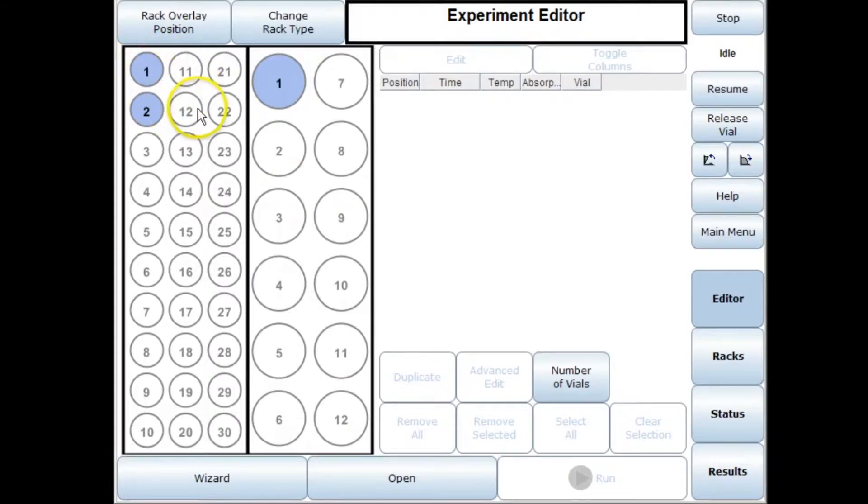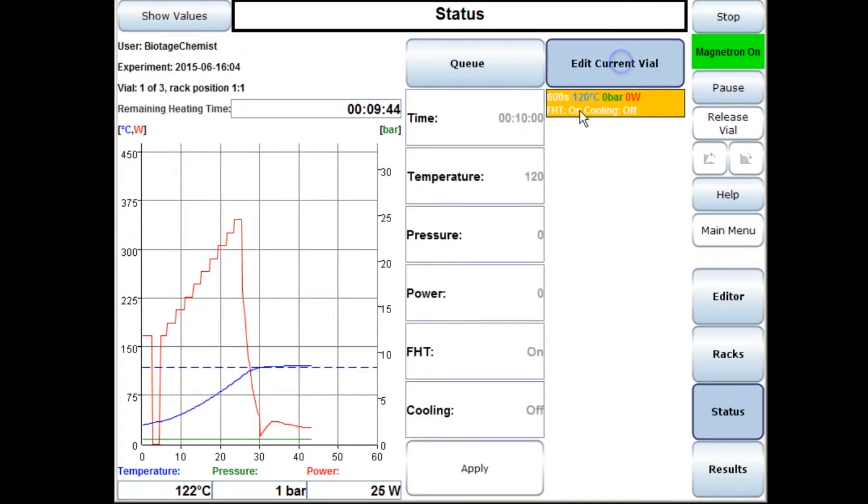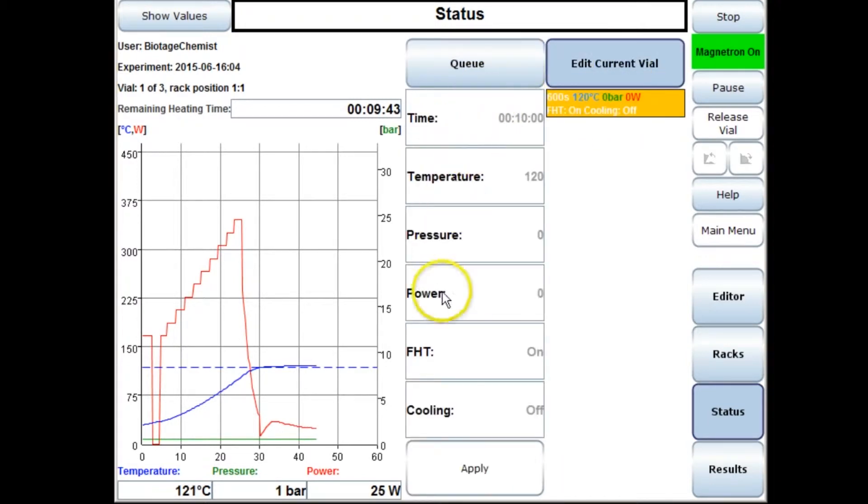You can see now I've got three different reactions in the queue and if you go to the status tab you can view the status of the current reaction. You've also got the queue and you've also got the option to edit the current vial.